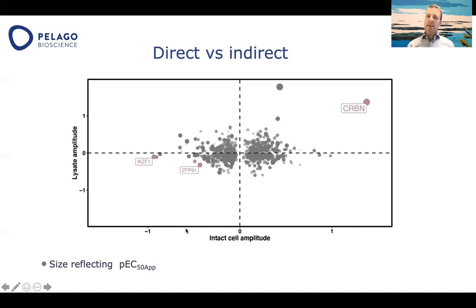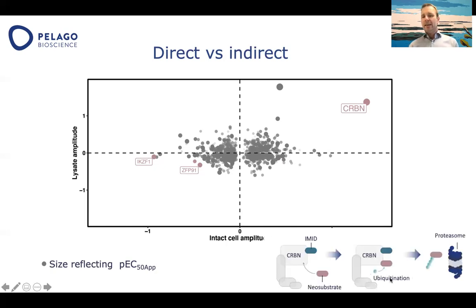So the interpretation is that this is not something that happens to a significant extent in lysate. It only happens to a significant extent in the intact cell. So therefore it is a downstream effect, exactly like we saw in the cartoon. In popular terms, you can say that in 2 experiments, we reproduced about 20 years of research, but that might be stretching it. But at least we see this mode of action in these 2 experiments.